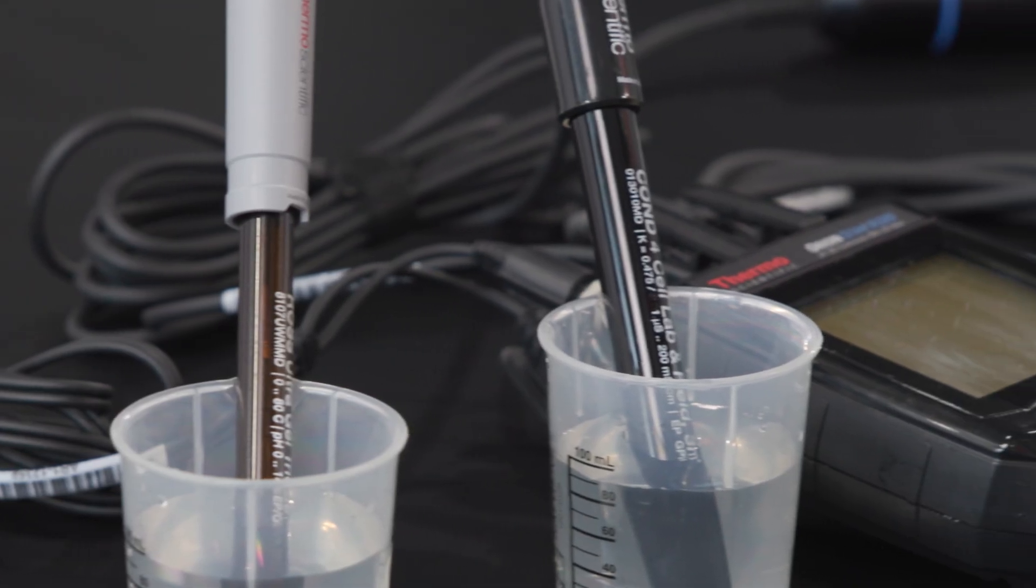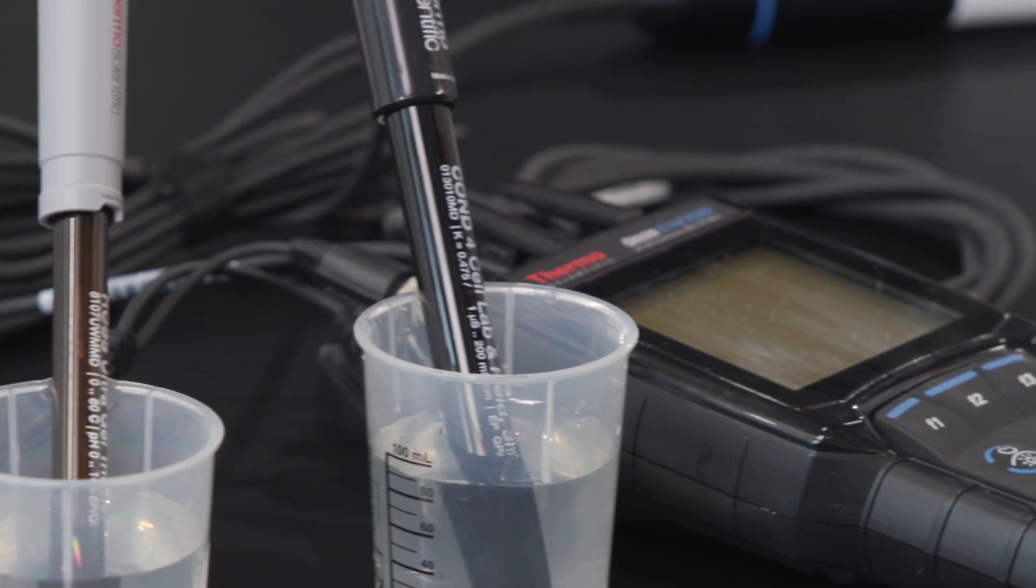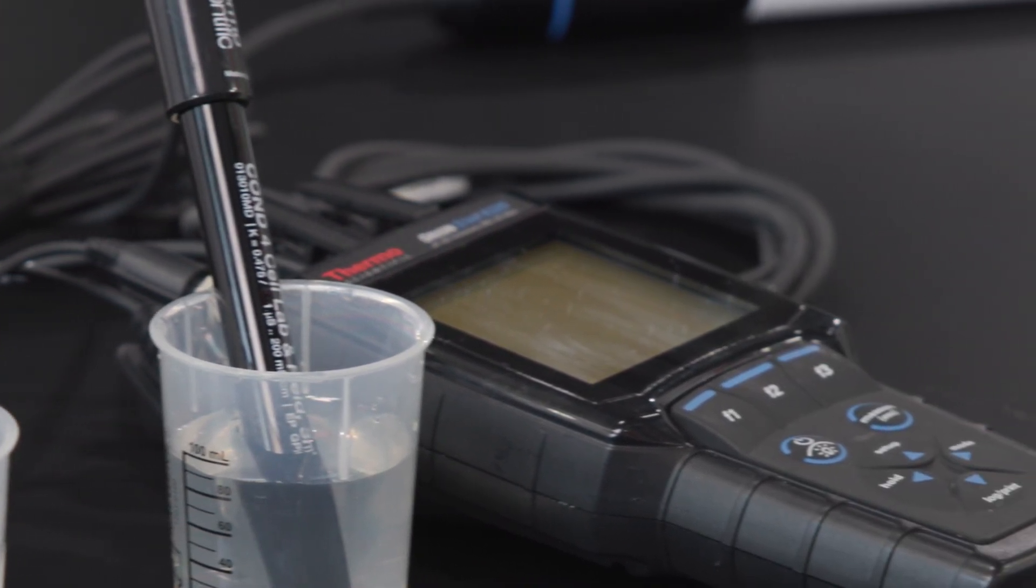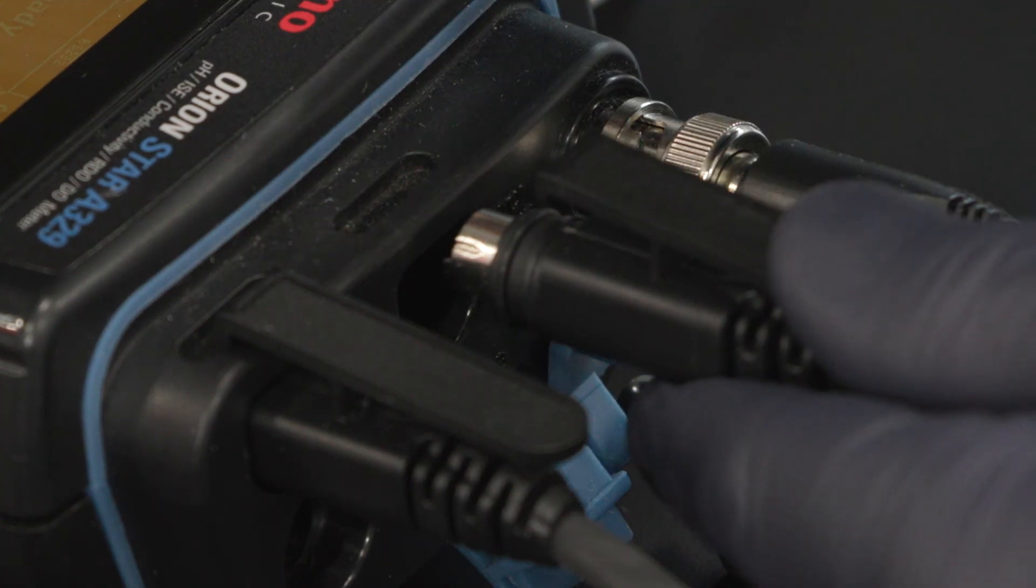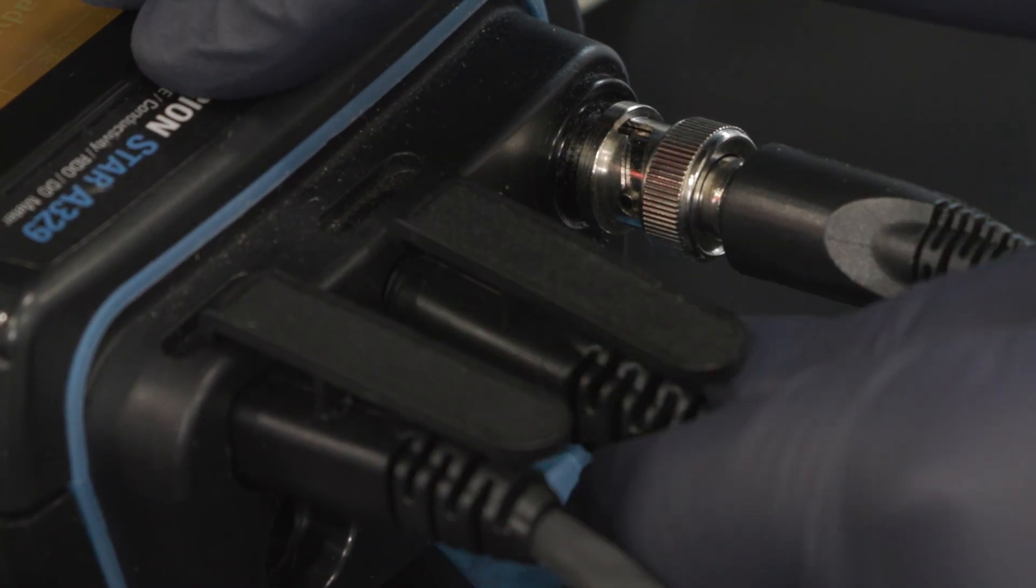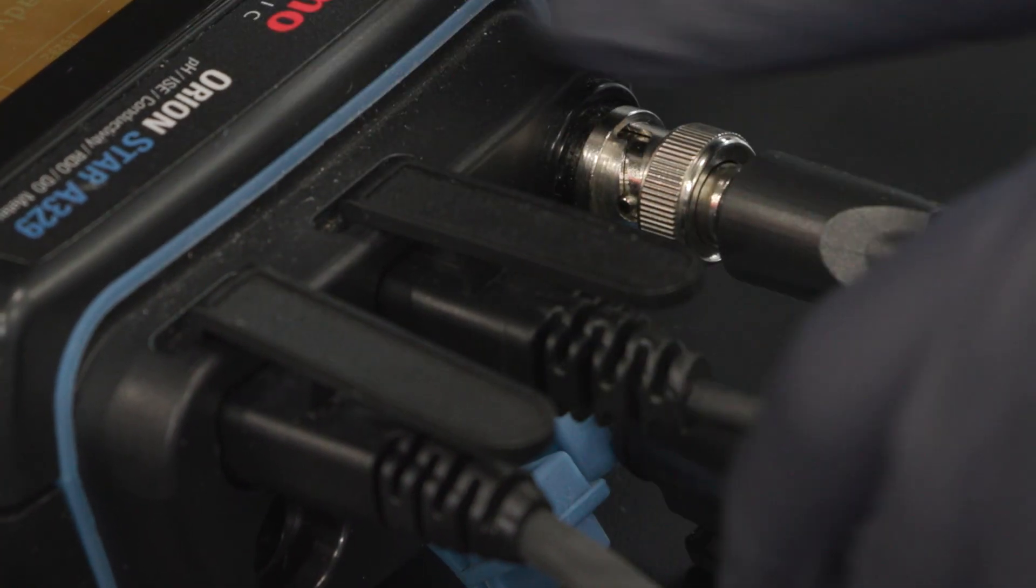If testing multiple parameters is a requirement, consider a meter with two or more channels. Multi-channel meters offer the flexibility and support of concurrent measurements. They eliminate the need for multiple instruments and help provide a more complete analysis.